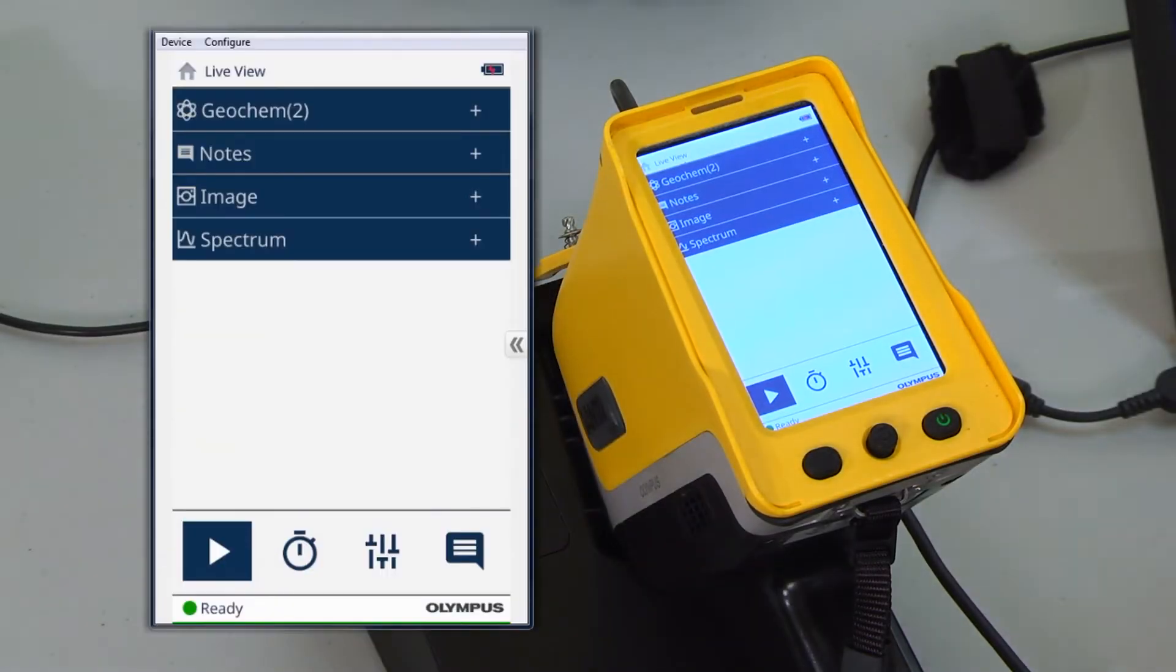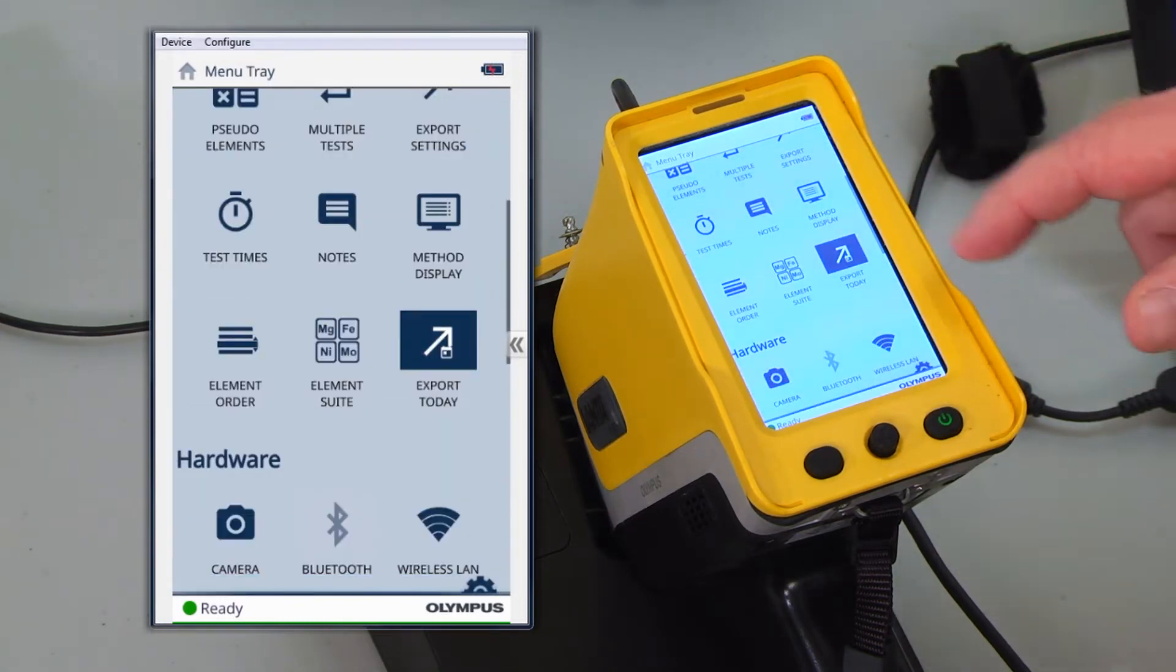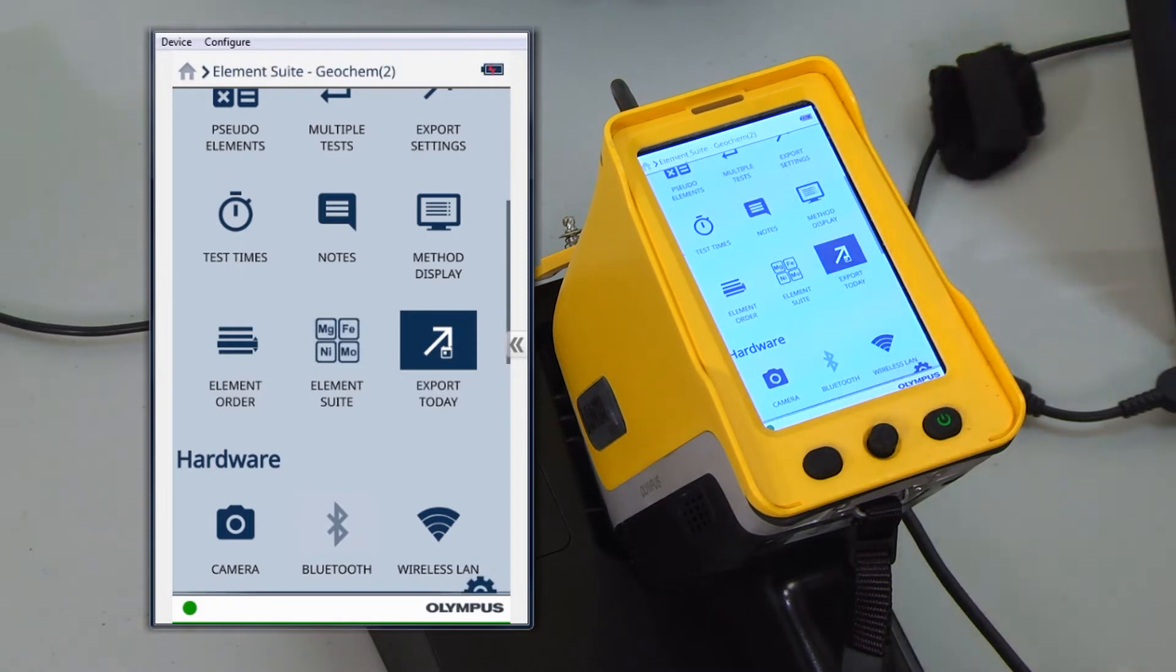OK. To see which elements are measured by which beam, from the main screen, we can swipe down from the right and tap on Element Suite.